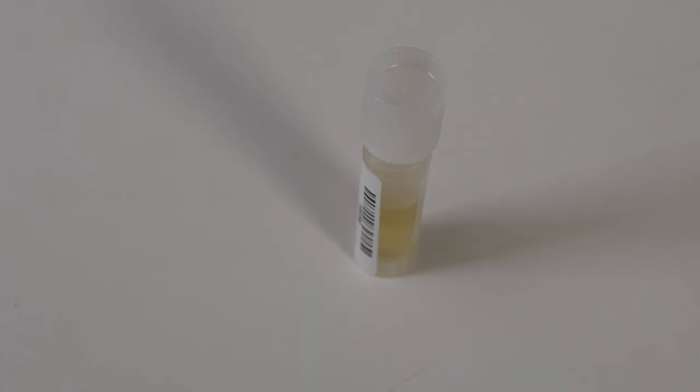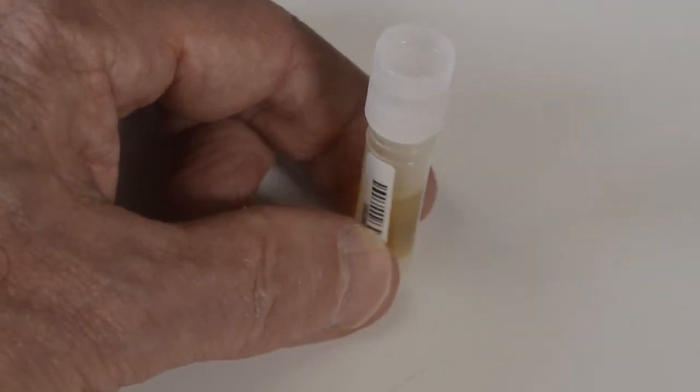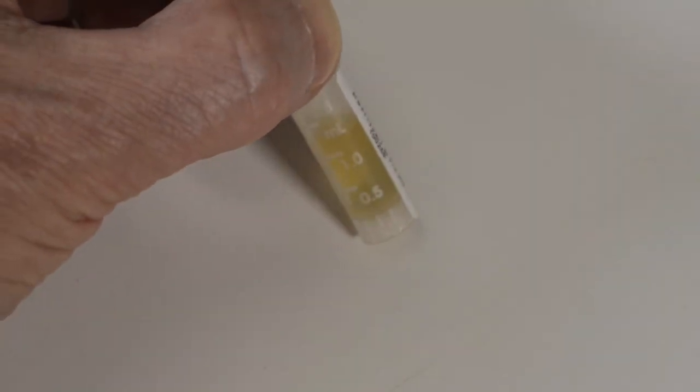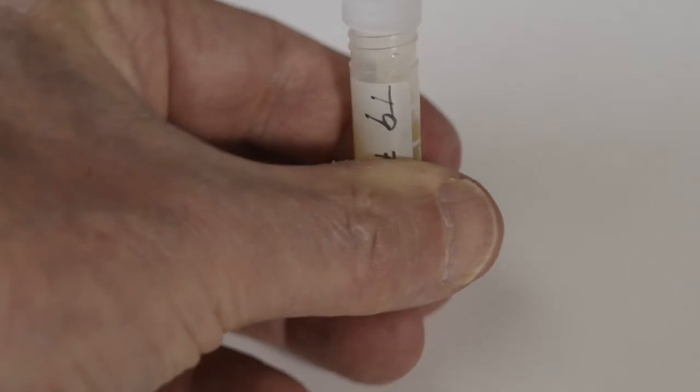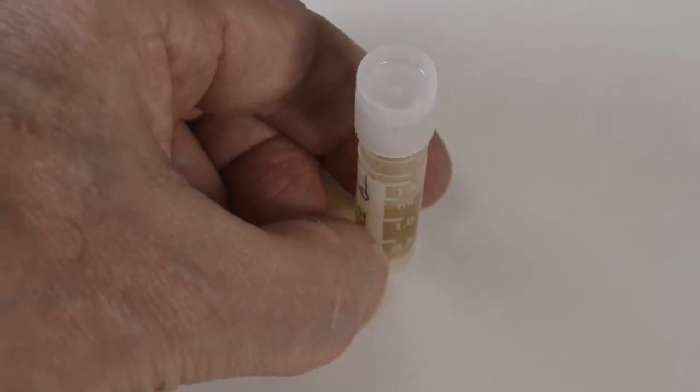Here you see a close-up view of the small 2 milliliter tube for making the stab cultures. Your instructor will provide you with these tubes. They'll have a barcode on them, also a labeling area. You should clearly mark the name of your sample on the tube.